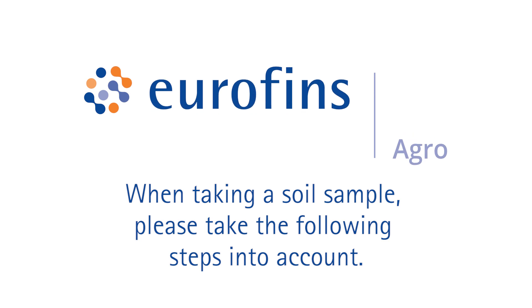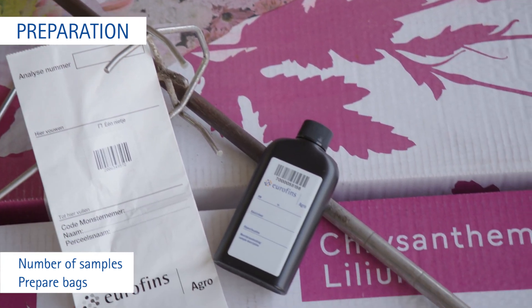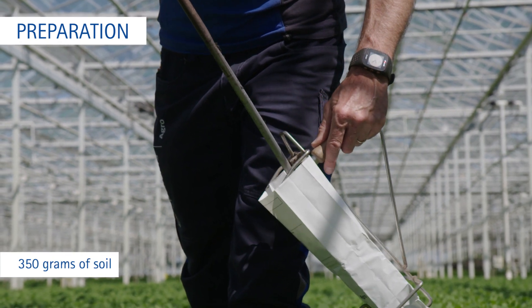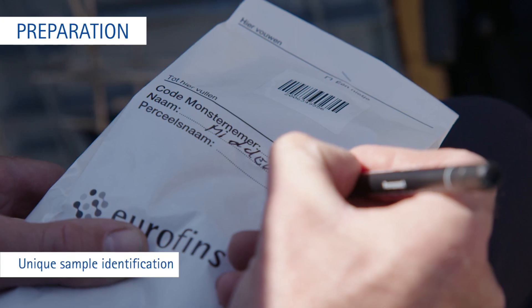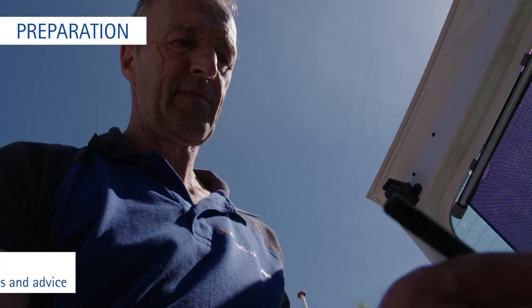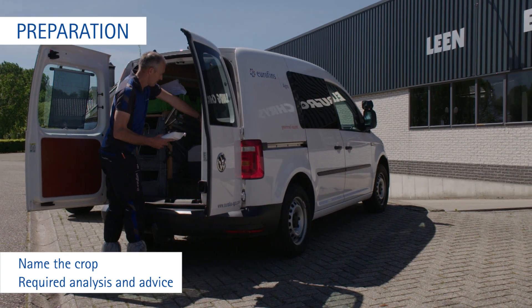When taking a soil sample, please take the following steps into account. Consider how many samples you need and prepare the correct number of bags. We need at least 350 grams of soil per sample. Please use our special sampling bags or use new opaque bags. Write your unique sample identification on the bag, and name the crop and the required analysis and advice you want to receive.